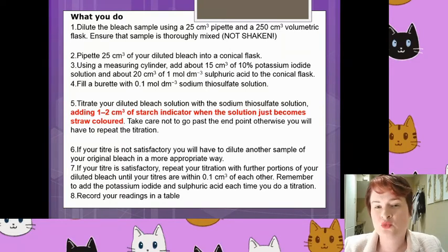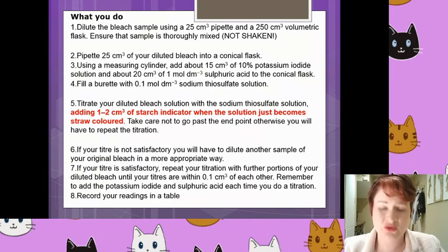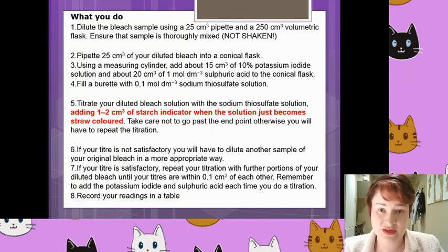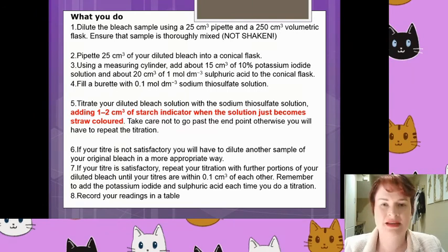You titrate it, adding just one to two centimeter cubed of the starch solution when the solution just becomes straw-colored. Now, some people have found this really tricky because what we are doing there is the sodium thiosulfate is going to start neutralizing any excess things that are left over there. And if you add the starch before this point, because the starch is a biological molecule, it is very sensitive to changes in pH. So if you add the starch too early, the proteins within the starch, or the biological structures within the starch, will be denatured and it will not work as an indicator. So you have to start neutralizing your solution earlier, and just when it starts going to a very straw-ish, yellowish color, then you add your starch solution. And it's usually about a centimeter cubed after that that the end point is reached. But you've got to go really slowly just in case, because, you know, those end points are always a little bit tricky there.